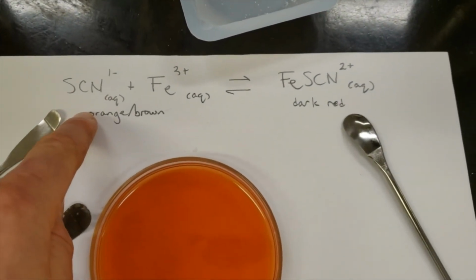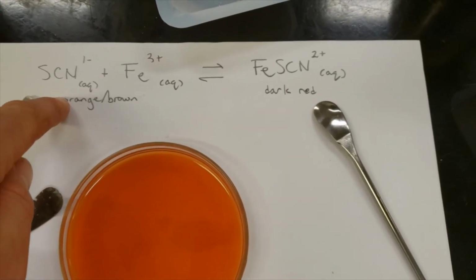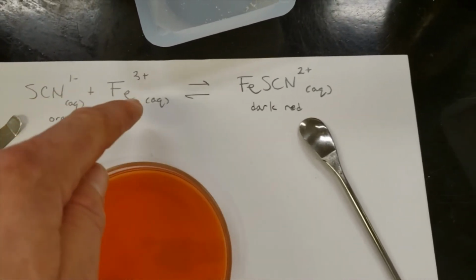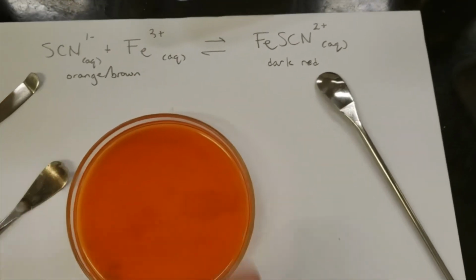So now by increasing the concentration of the thiocyanate ion, that's increased the rate of the forward reaction, and I've shifted the reaction towards the right-hand side, and the solution gets darker.